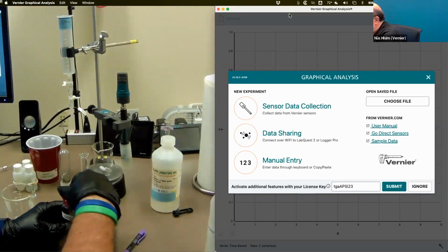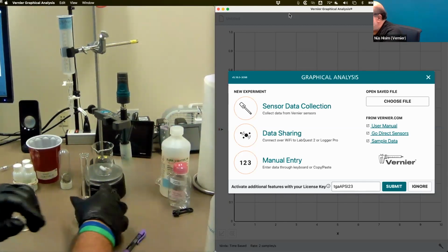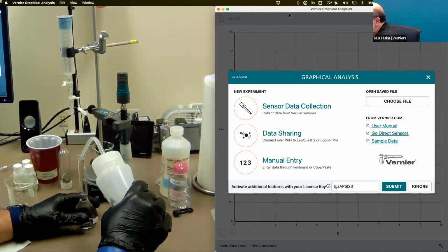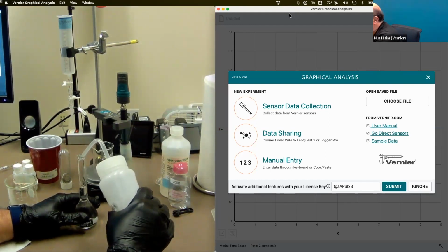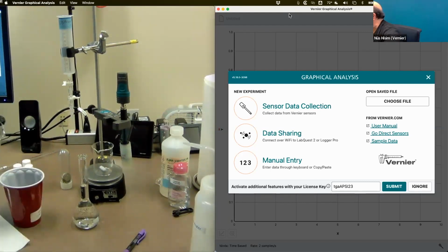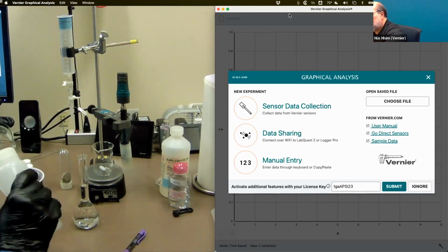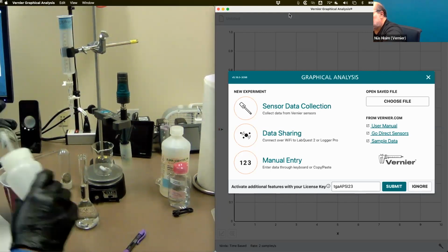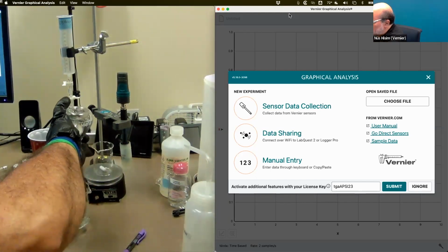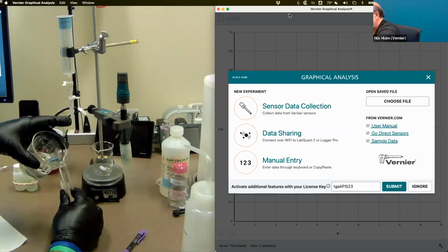Get this out of the way so I don't knock it over, because that could very well happen. All right, let's top it up. And I ruined that, didn't I? I was going to use this beaker as my stirring beaker, and I went and put some sodium hydroxide in there. So let's clean that out. So there is my diluted sample ready to test.